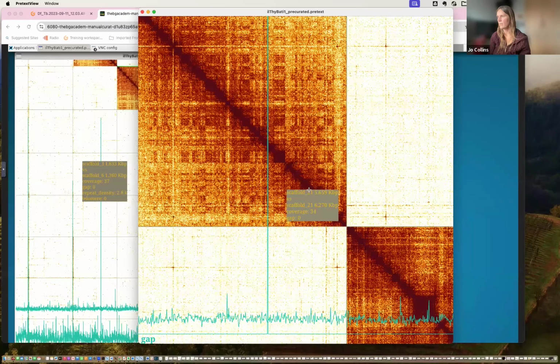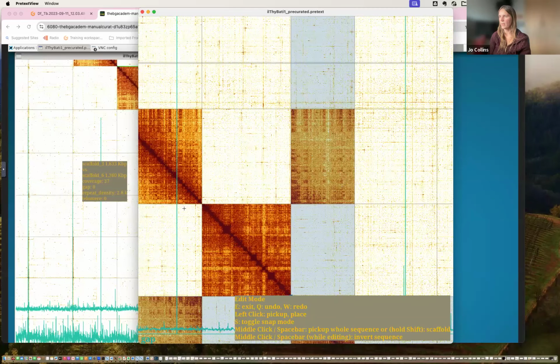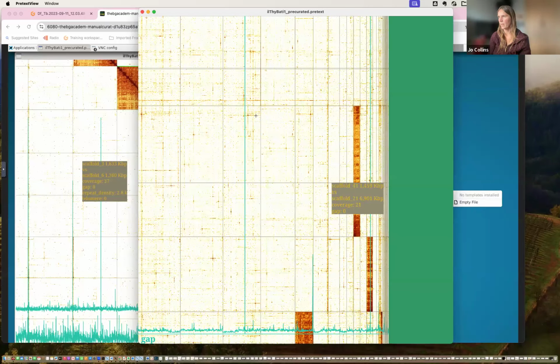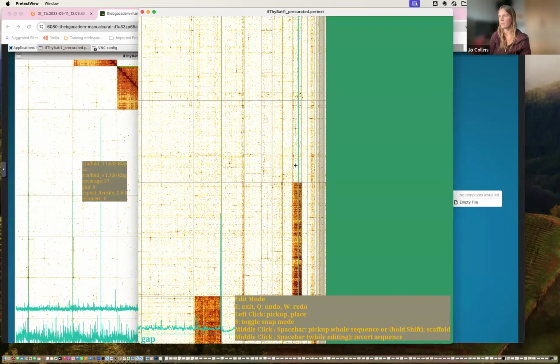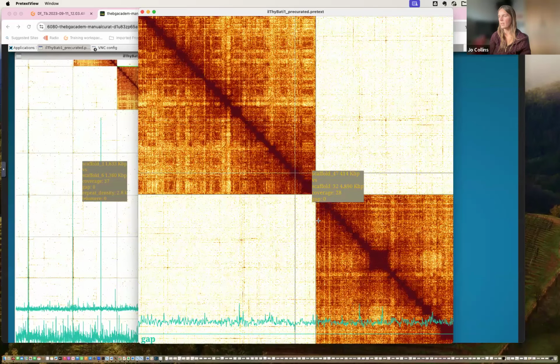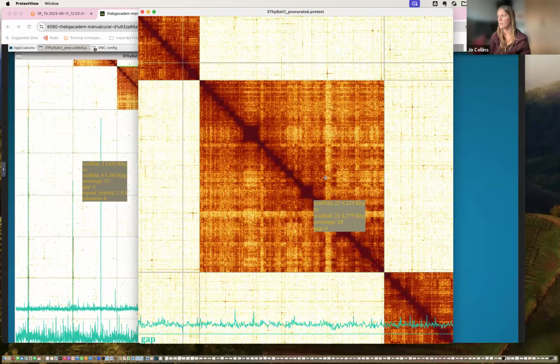It's okay. We've got another scaffold here with a really strong contact. So we'll pick that up, move that in. We've got a nice contact all the way through our join. Now we come back, we've got another scaffold, really strong signal. The bottom scaffold, now we've got really strong signal through that join. Look through here, nothing obvious to break.